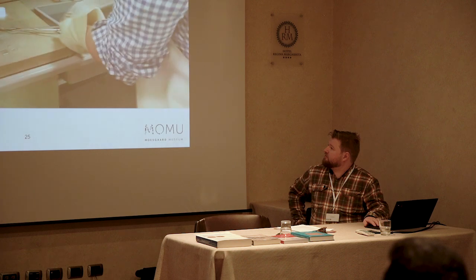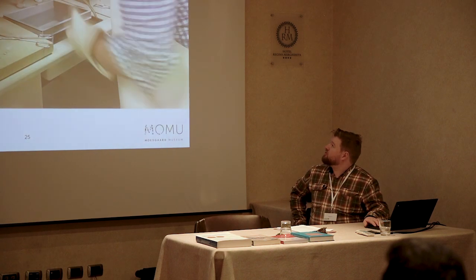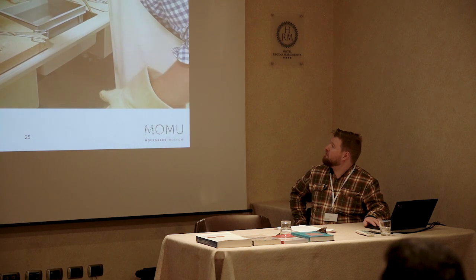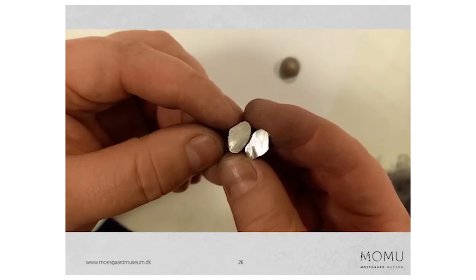This is us recently doing some silver mixing. Rasmus decided to volunteer himself for taking these risks. I did the filming. But we're mixing silver, analysing it before and after, because there's a lot of theoretical models on mixing. I'm very much an empiricist. I want to check that physically.